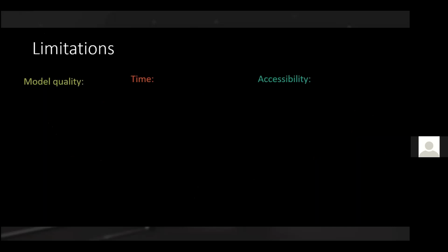Now, in particular for this audience that might be interested in potentially using this device for research, I thought we should briefly say that there are still some meaningful limitations. There are limitations on specimen size. I briefly noted this. The small size is to some extent just controlled by optics, so if you have multiple lenses available, that is addressable. The large size is currently limited by the dimensions of the scanner, so if you build a scaled up version, larger sizes are possible. But with the system that's currently built, I think it's between 5mm and 8cm is the maximum size.